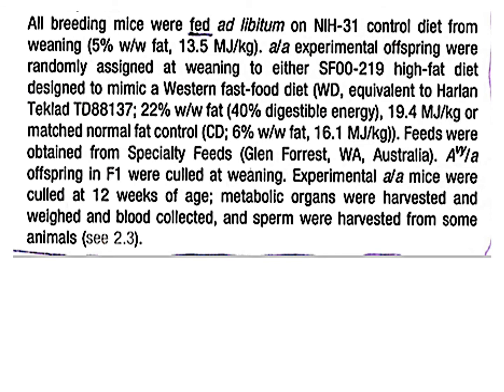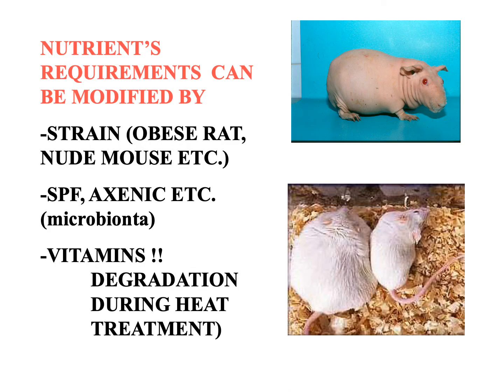Okay, and we will go to the picture that illustrates that the nutrient requirements can be modified by strain.